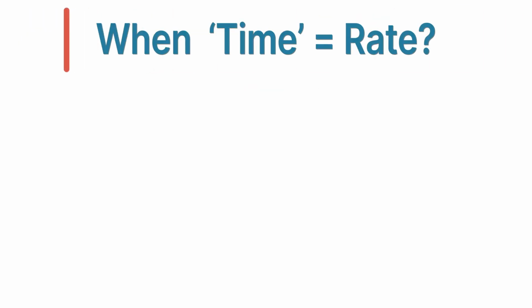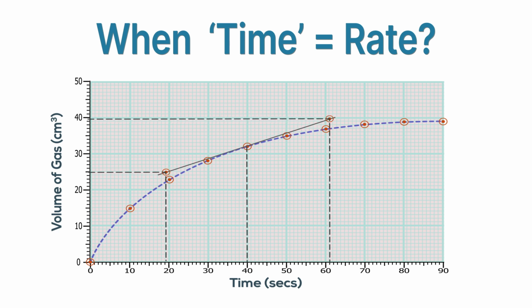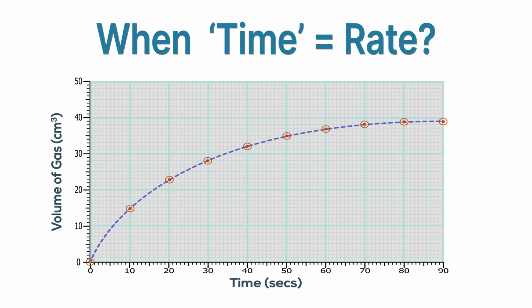It is important to recognize that the data we are gathering here is simpler than the data we have seen in previous experiments. In all the other videos in rates of reaction up to now, we have gathered data on the volume of a product or the mass of a product over time to give curves like this one. These graphs give us a lot of information. How much gas has been produced by a certain time or by the whole reaction. We can find the average rates of reaction and also instantaneous rates of reaction for any time point during the reaction. These curves also allowed us to compare reactions under different conditions as they happened in parallel.